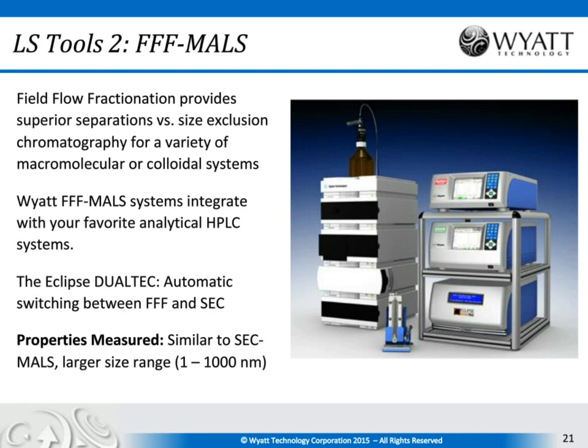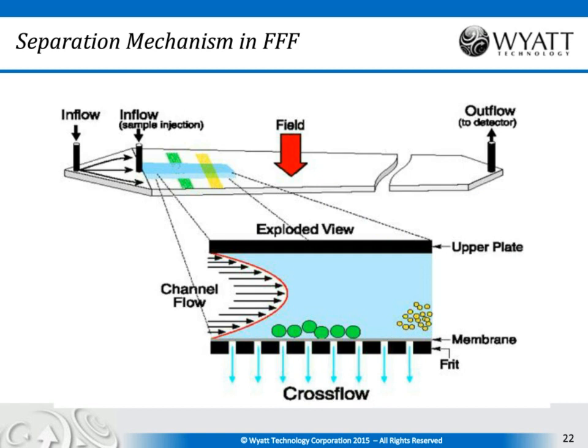So briefly, how FFF separation works: instead of having a packed column, we have a very simple channel, which is just 2 plates with fluid in between. The top plate is just a solid plate, and the bottom interface is a frit, which supports a semi-permeable membrane, very similar to a dialysis membrane.